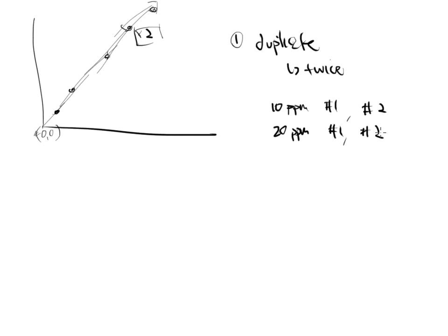So all of a sudden, you're probably going to automatically think, oh dear God, I've got 5 standards and these people want me to run each one of them 2 times, which will give me 10 standards in total. Yeah, sometimes it is that strict in an analytical laboratory. Now, we need to step back and question why. You know, why would they want to do something like this in a lab? Why would a lab manager come around and say you need to inject these standards twice? One time is not good enough.